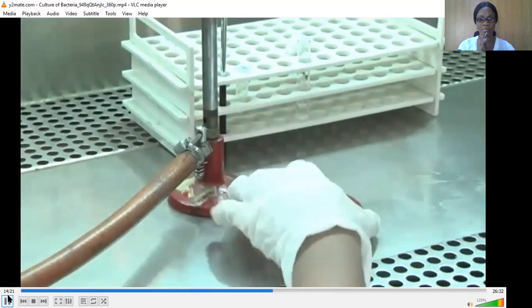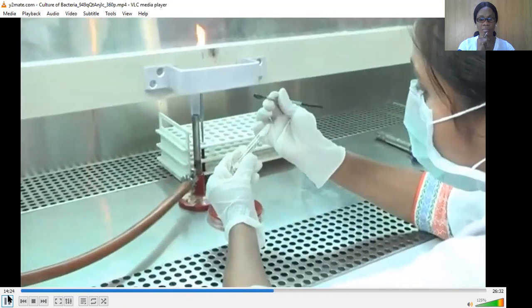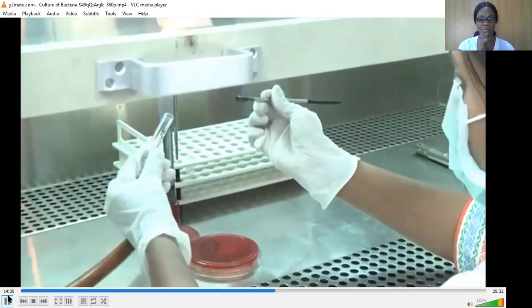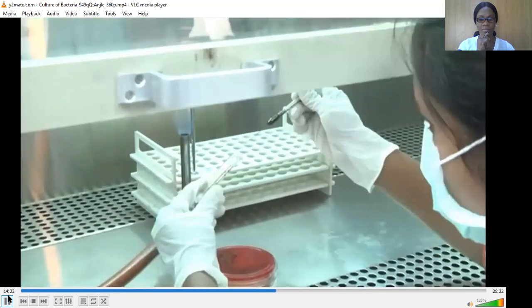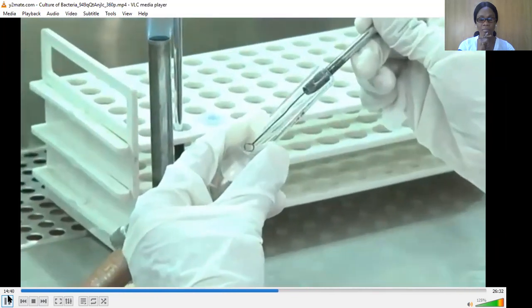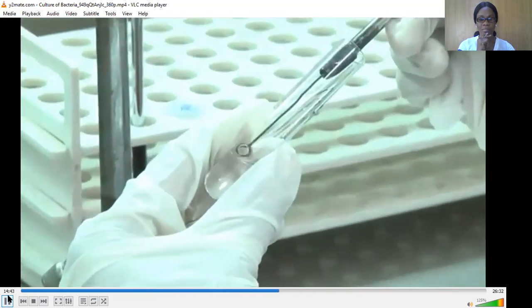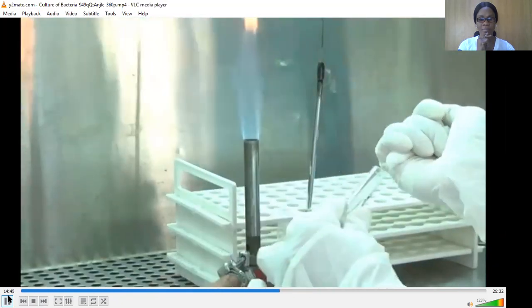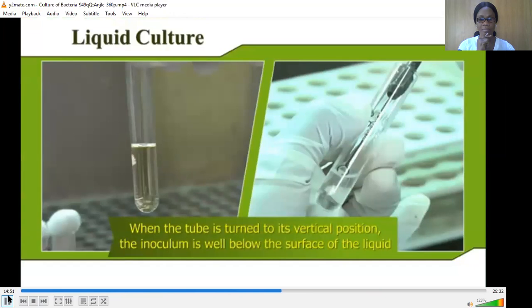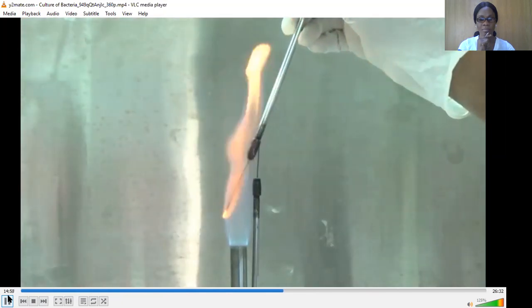Replace the lid. Hold the liquid medium in your left hand and remove the cotton plug or cap with the little finger of your hand and flame the neck. Now, incline the bottle at an angle of 45 degrees and deposit the inoculum on its wall above the surface of the medium. Replace the plug or cap. When the tube is turned to its vertical position, the inoculum is well below the surface of the liquid. Sterilize the loop before keeping it down.